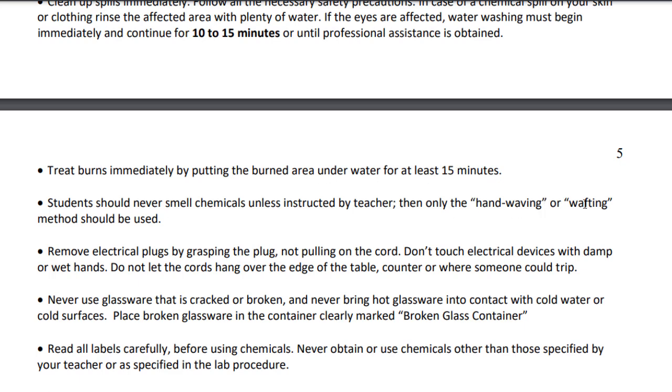Hand wafting or hand waving is the way that you're going to smell some stuff. Our very first lab on your first day back, you're going to be doing wafting, and I'll go over this again with you. It's basically, imagine that you have a coffee cup in front of you and you want to smell it. Instead of shoving your nose over the top of your cup, I want you to hold the cup, take your hand and just kind of bring the steam towards your face instead of actually shoving your face in the cup. That's what wafting is. It's just bringing the smell to you rather than bringing your nose to the smell.